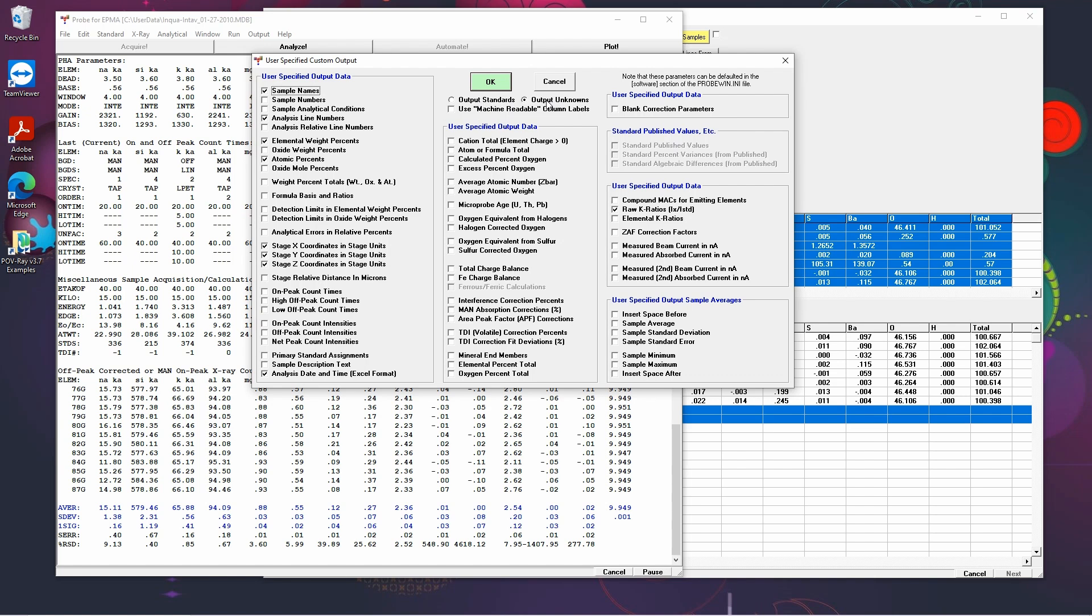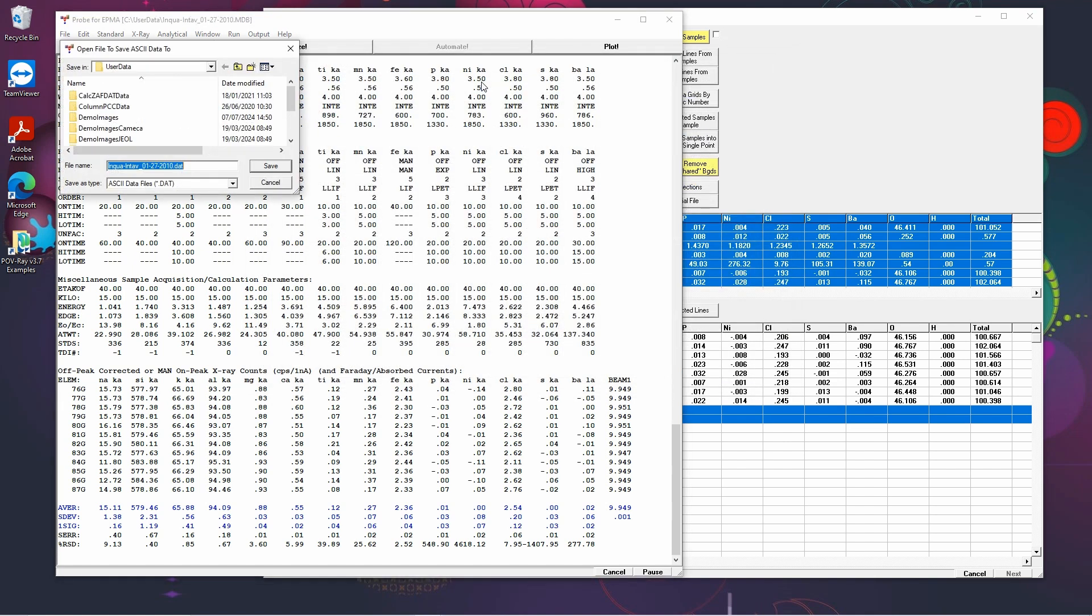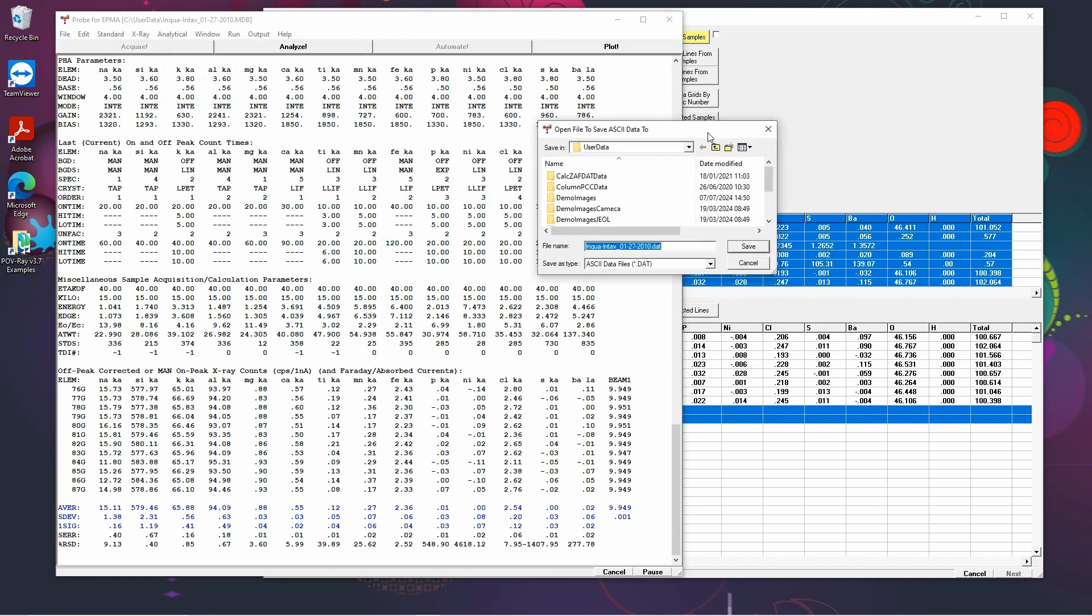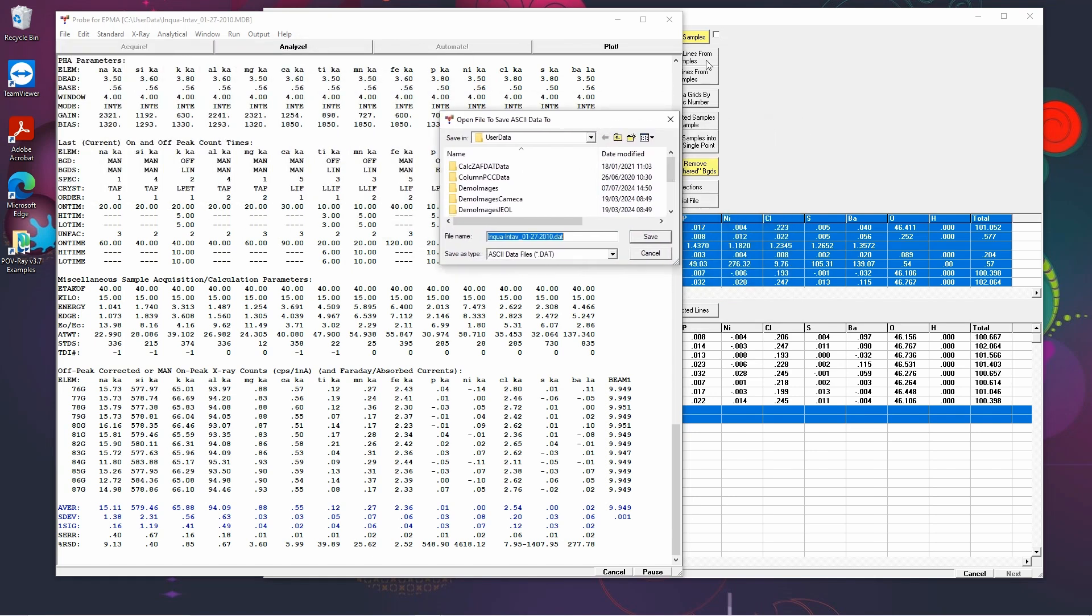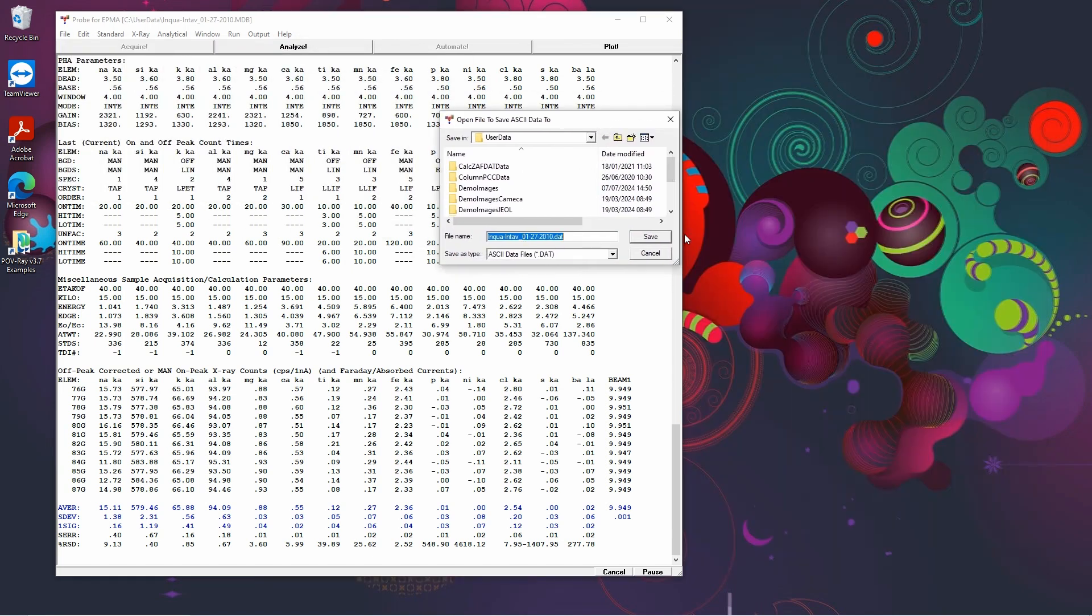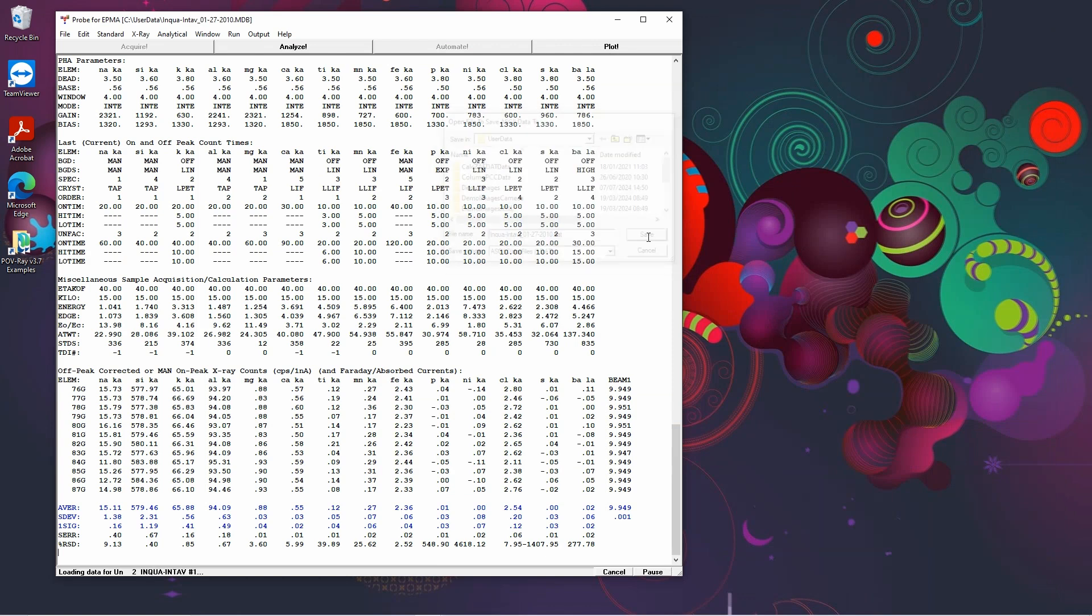So we've got the unknowns selected here and there's a huge number of checkboxes of what values we would like to output which pretty much covers everything you might need to do. When you click OK here, you're given a DAT file which is actually an ASCII text file. This is going to be the data for all of your samples. So if we click save.